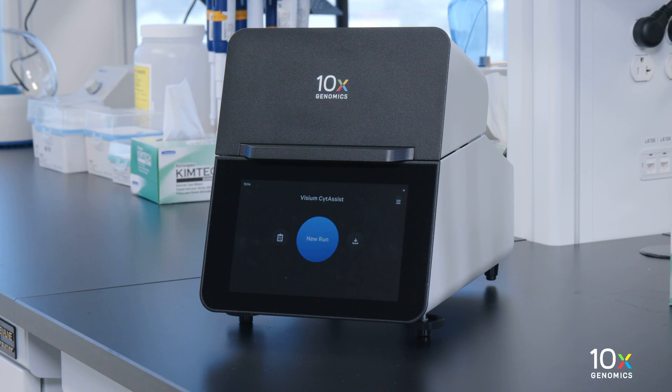Ensure that the Visium CytAssist is powered on, clean, and ready for an experimental run.